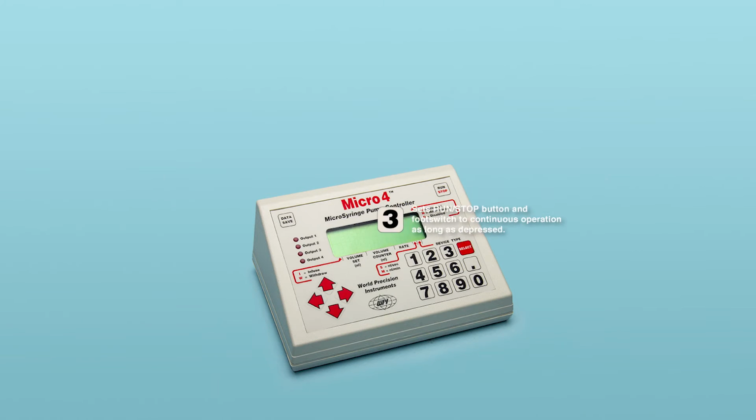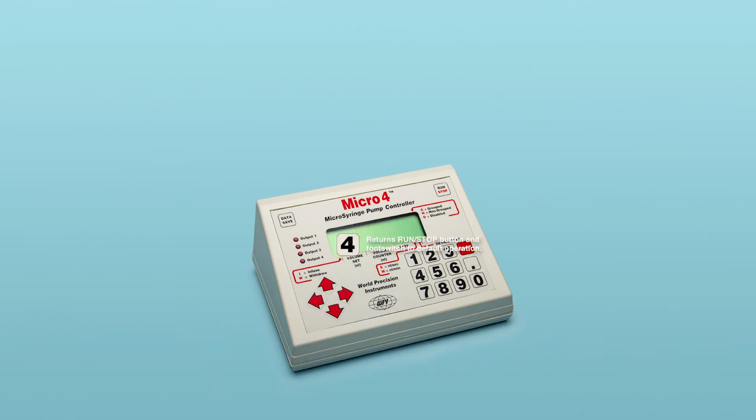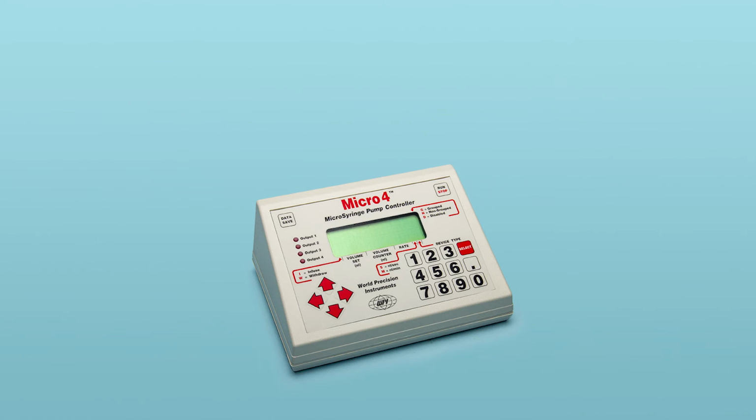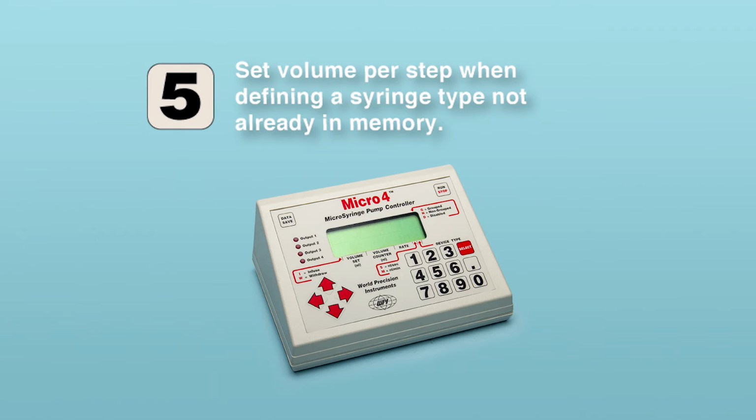The 3 button changes the action of the Run Stop button or the foot switch to operate as long as they are pressed and stopping when released. The 4 button returns the Run Stop to its normal default operation. The 5 button sets the volume per step when defining a syringe whose parameters aren't already stored in the Micro4's memory. You'll need to study the instruction manual for this.